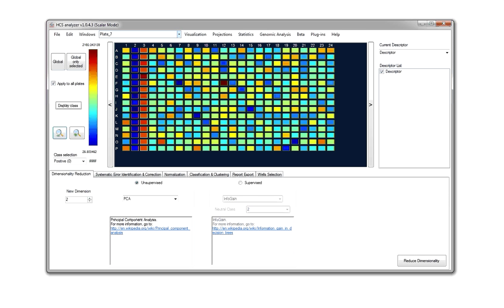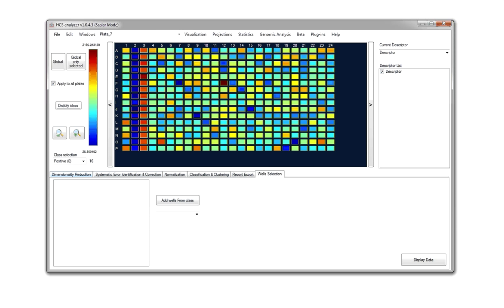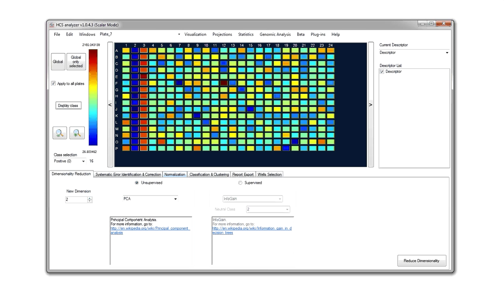So basically, what you have in this user interface is, as I said, the current plate, the lookup table, and here a description of your screening. You have a number of different menus that will be useful for the next part. And above, you also have access to other information or processes that we will describe in the next tutorial.